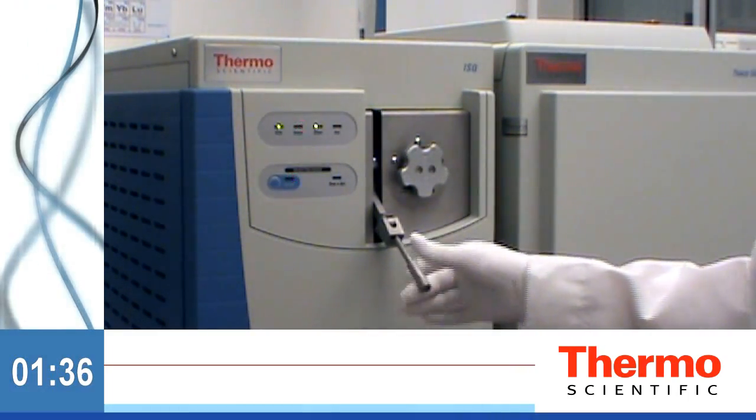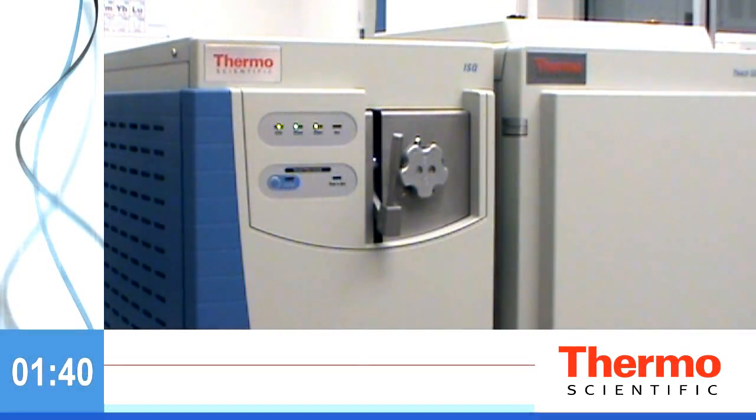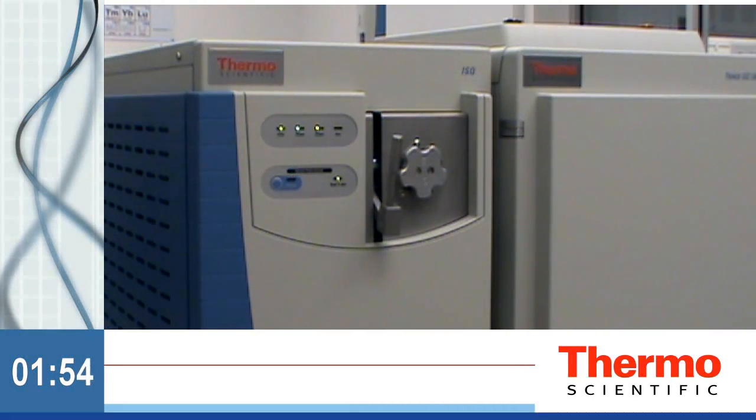Just think — a process that has always taken hours to perform and required you to vent and disassemble your GC-MS system now only takes seconds. Regain lost time and redefine GC-MS uptime. Rethink the way you look at GC-MS productivity. Stop venting with the revolutionary Thermo Scientific ISQ GC-MS system.